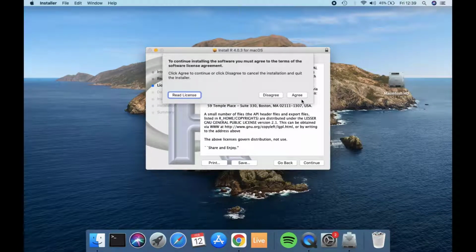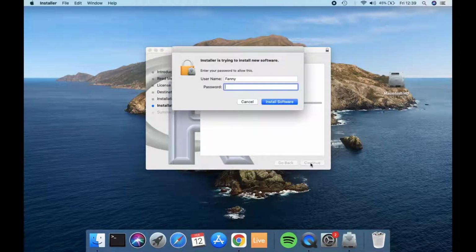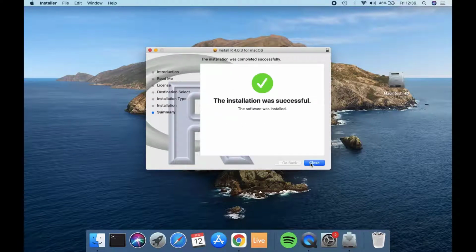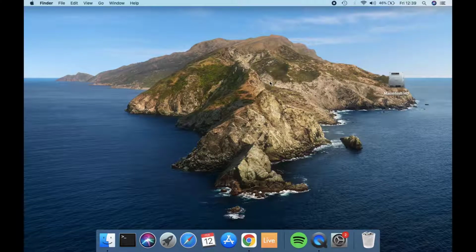So just follow everything. We don't need to change anything. We just want the default installation. So I'm just going to need to give the password, and now it's installing. So again, I'm going to speed up the video. All right, it's done.